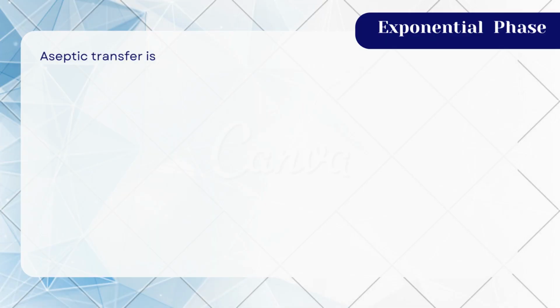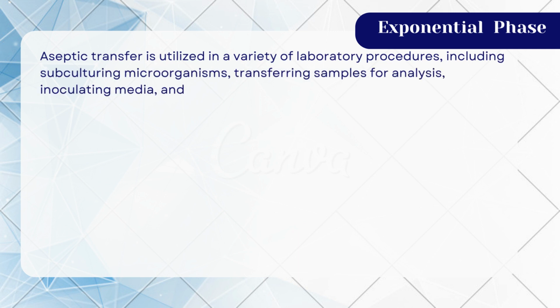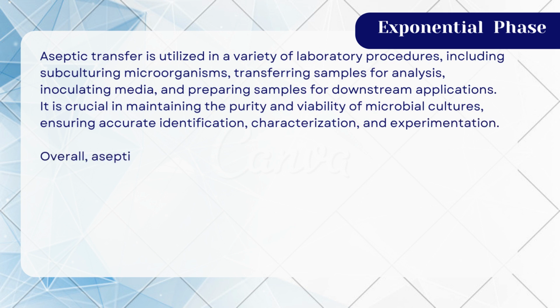Aseptic transfer is utilized in a variety of laboratory procedures, including subculturing microorganisms, transferring samples for analysis, inoculating media, and preparing samples for downstream applications. It is crucial in maintaining the purity and viability of microbial culture, ensuring accurate identification, characterization, and experimentation.